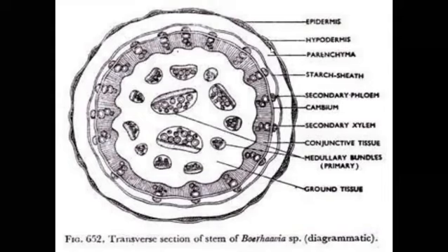And below this epidermis, cortex is present. One more important point: epidermis gives a perfect shape to the shoot and protects the inner parts. The ridges and furrows are also clearly visible in the TS of shoot. So below the epidermis, cortex is present. The cortex is divided into two major portions: hypodermis and inner cortex. Hypodermis is also called outer cortex. Inner cortex is also called normal parenchymatous cortex.